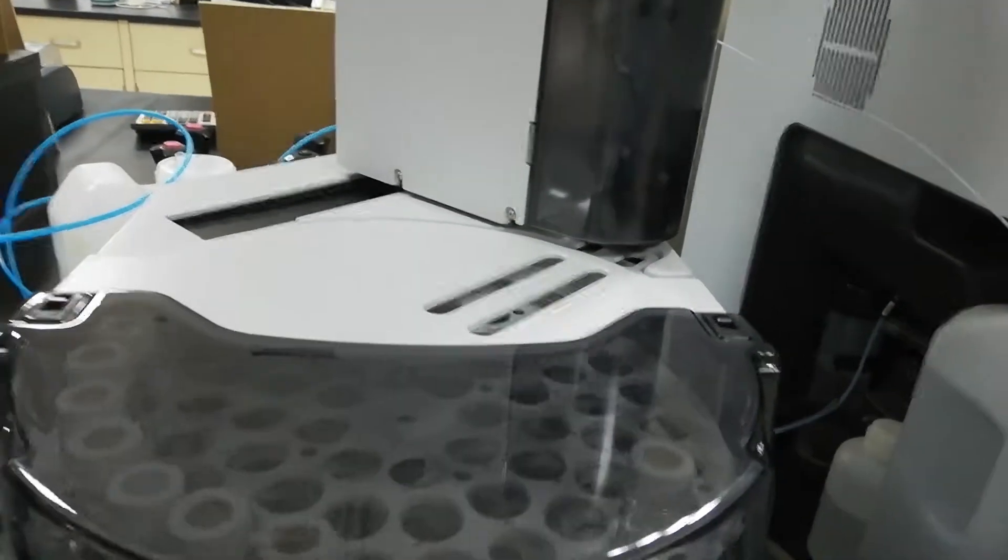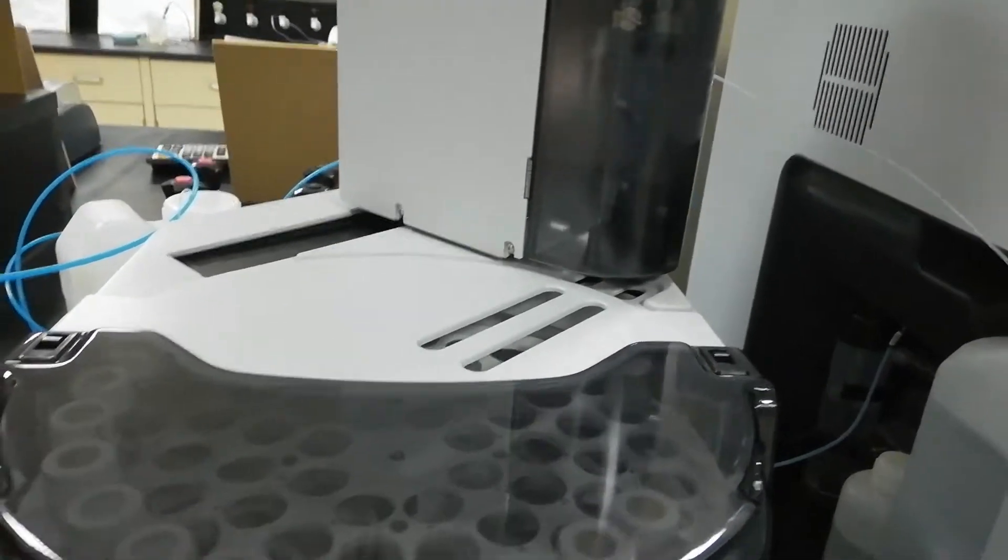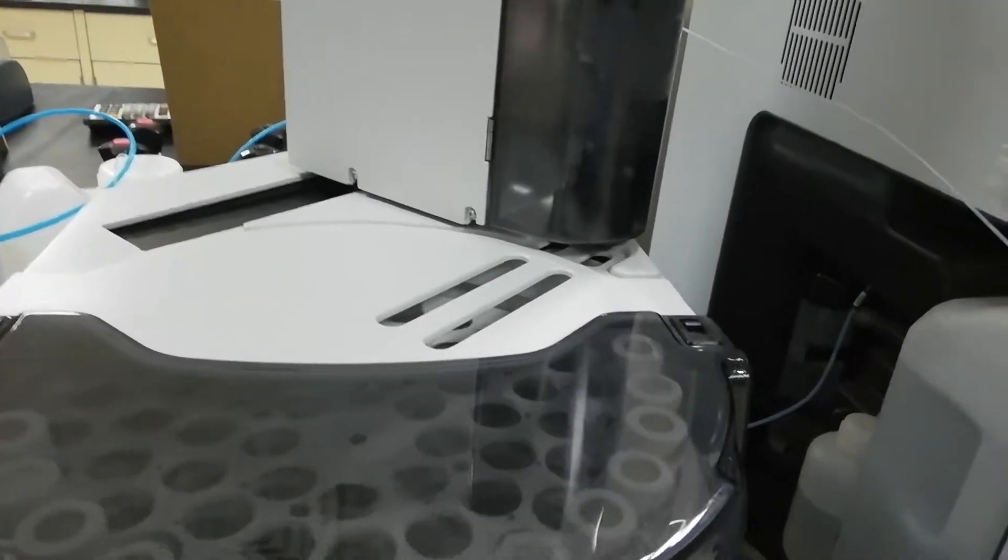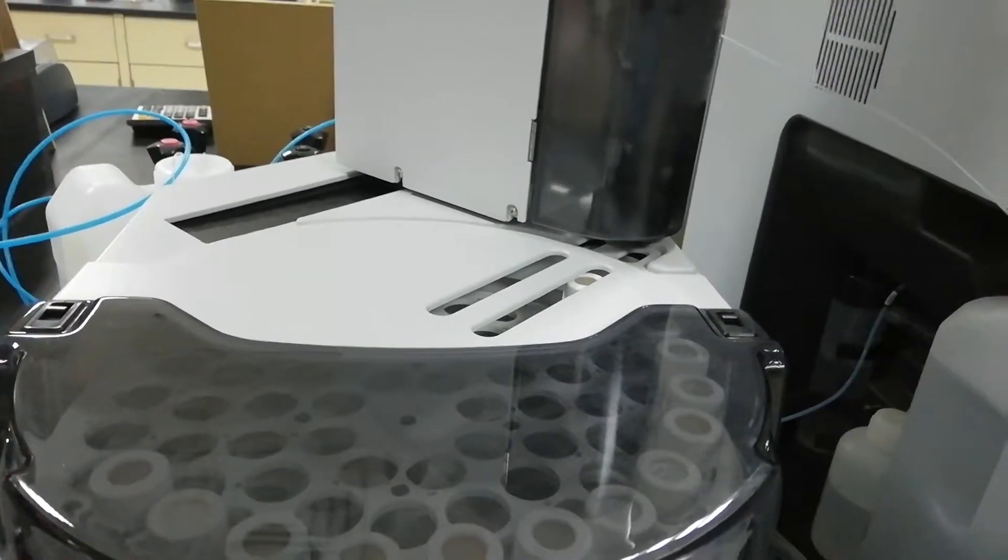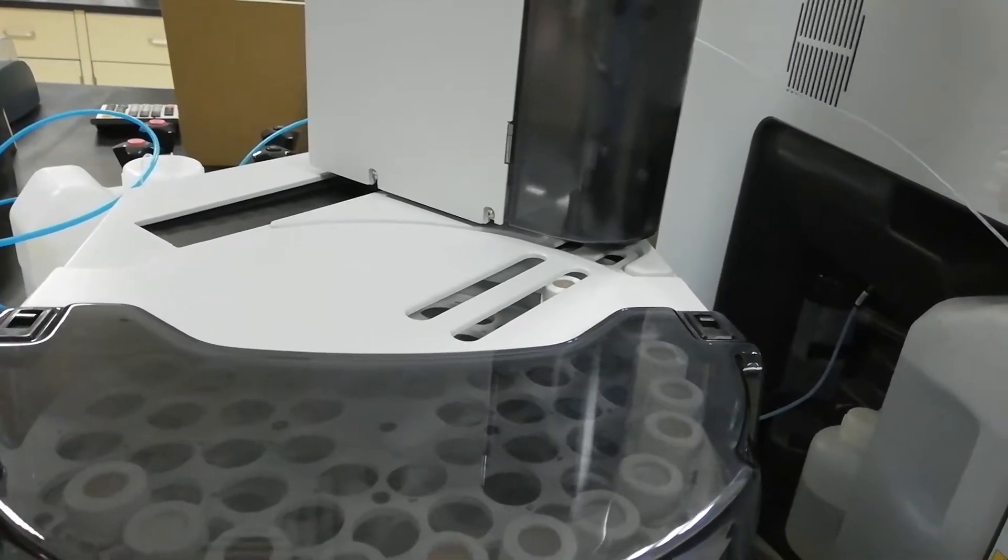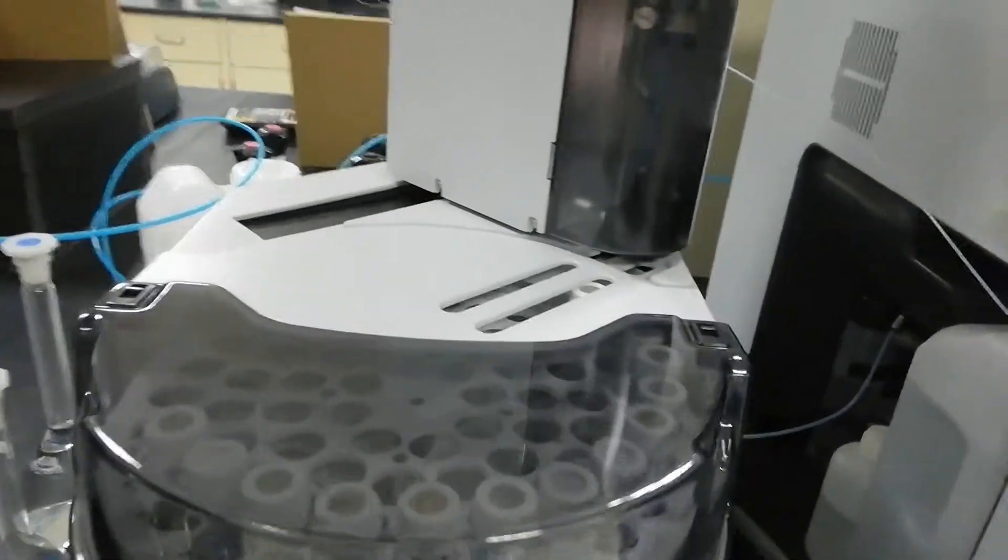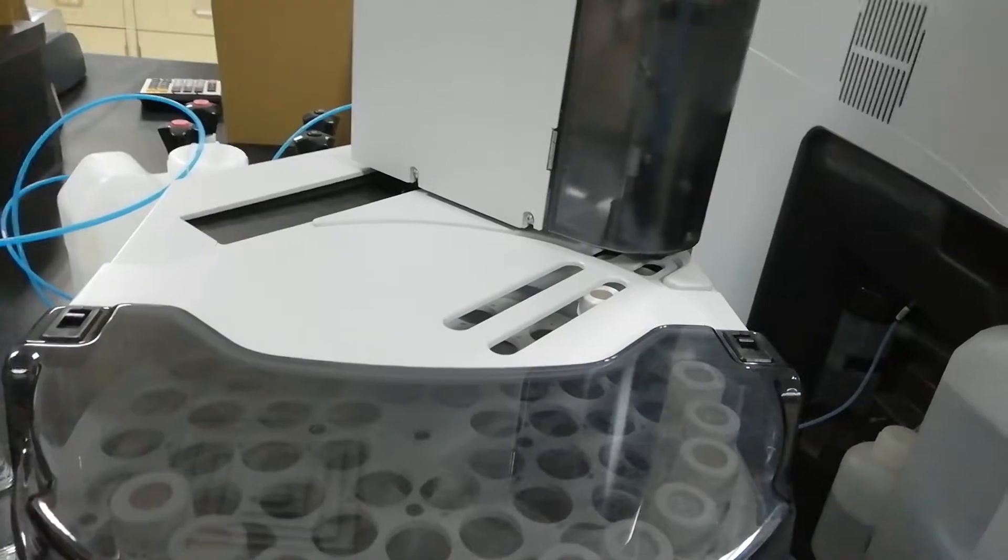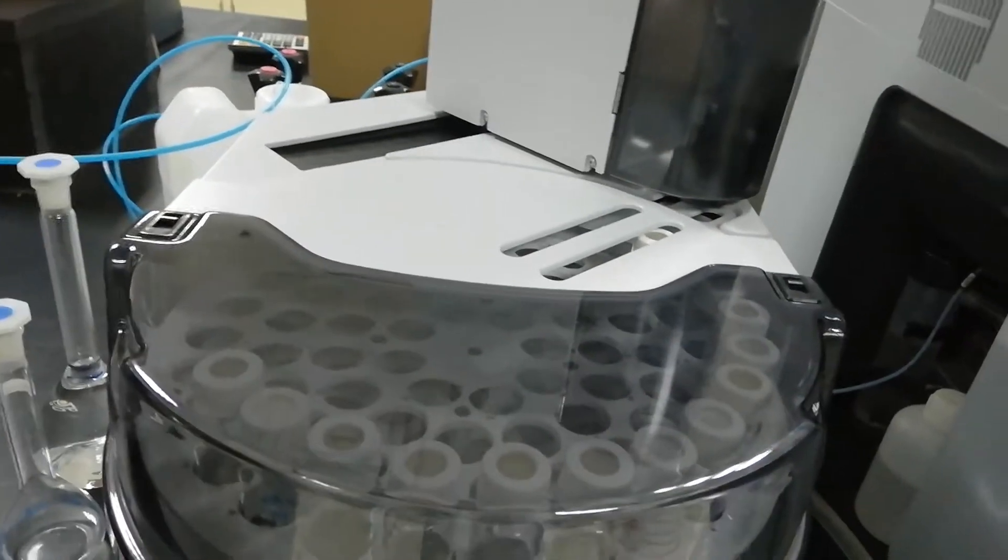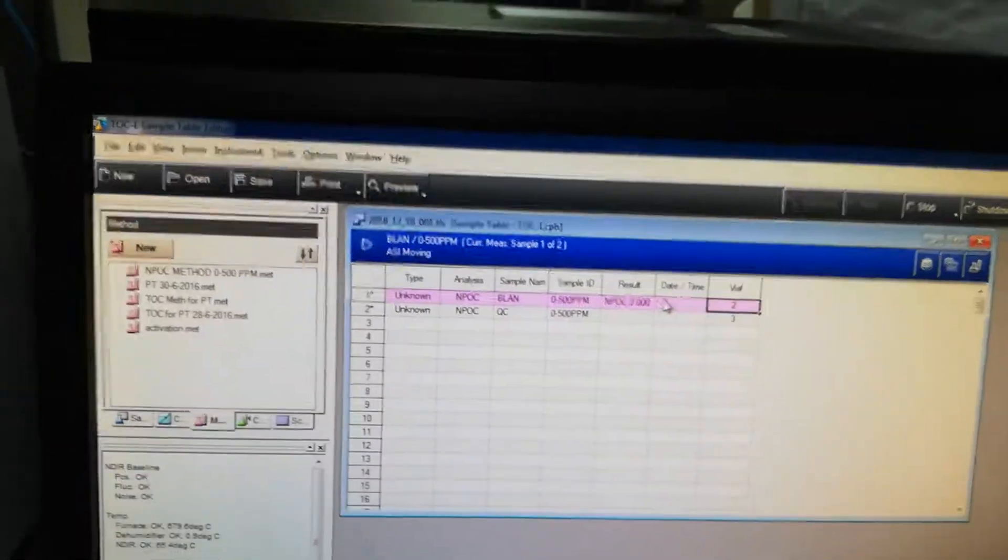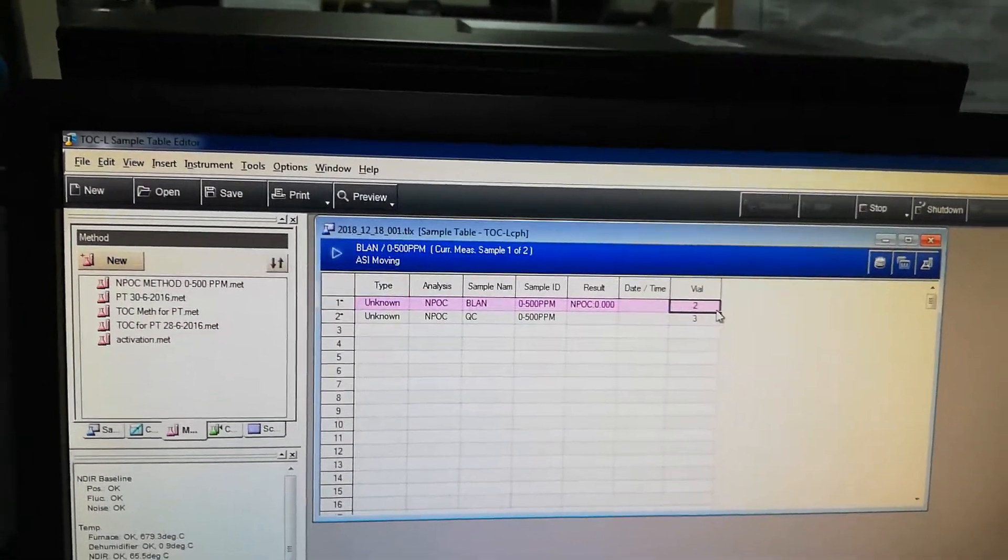So it will take the exact vial which you have entered there, and then it will start the analysis. So up to here, it was the operational part of the TOC analyzer - that how we will enter into the sample table, how we will take the method, and how we will start the analysis.